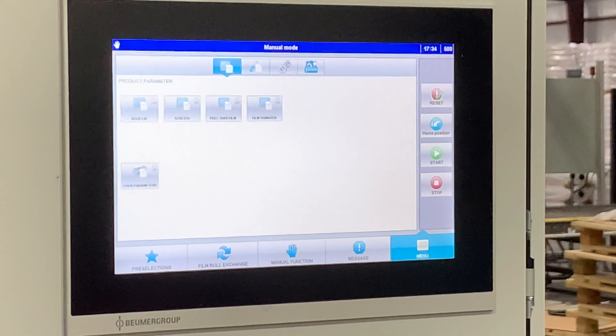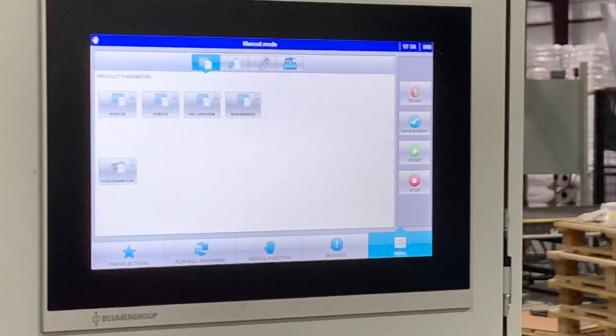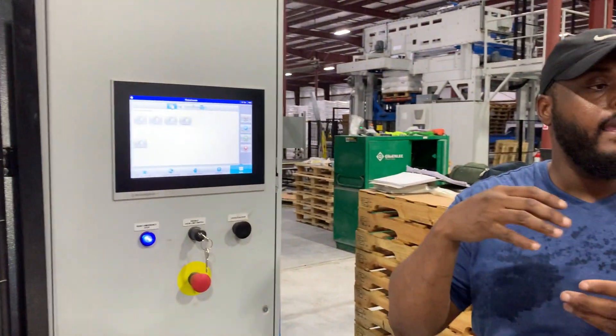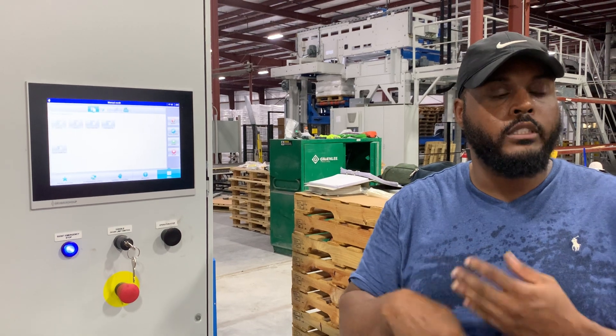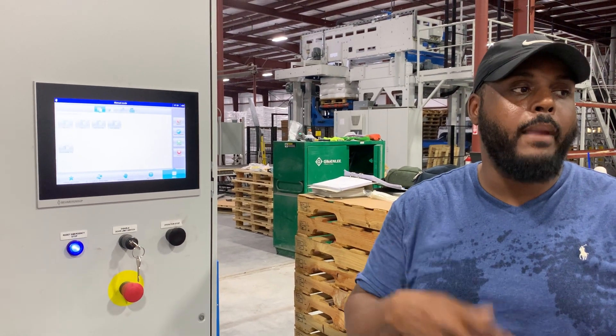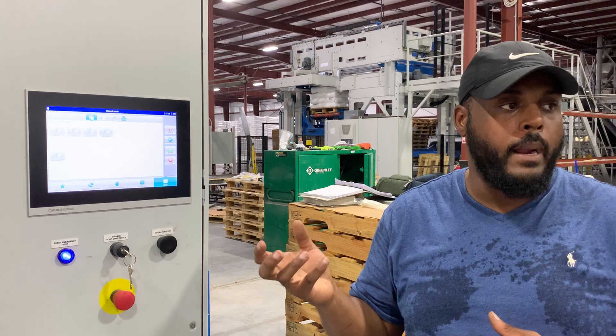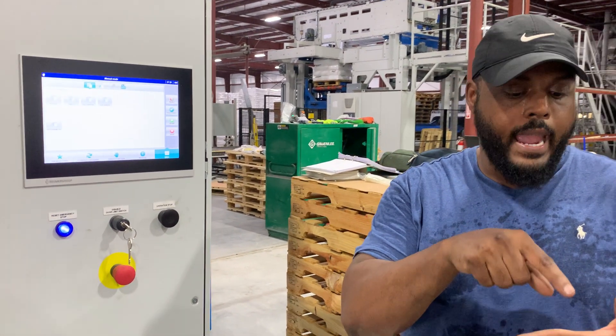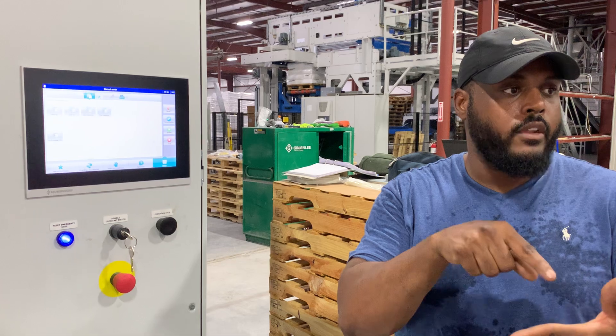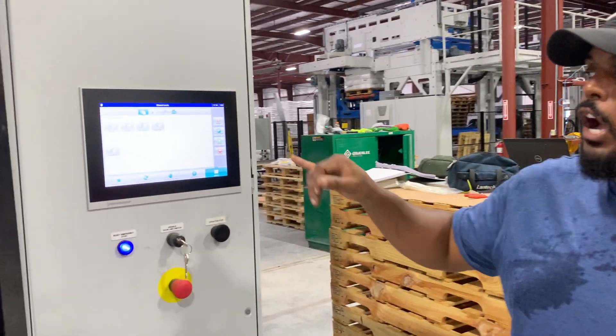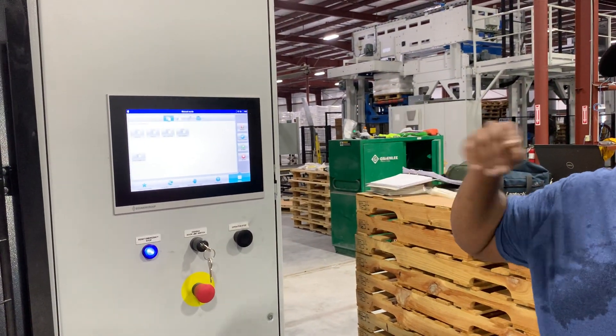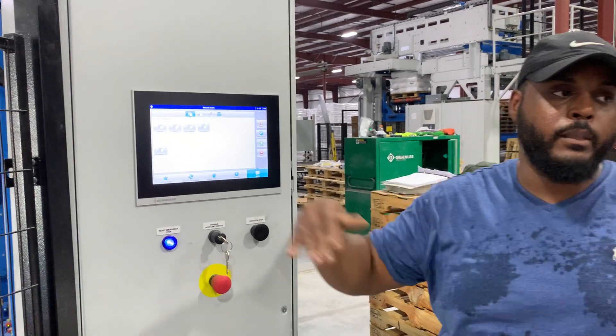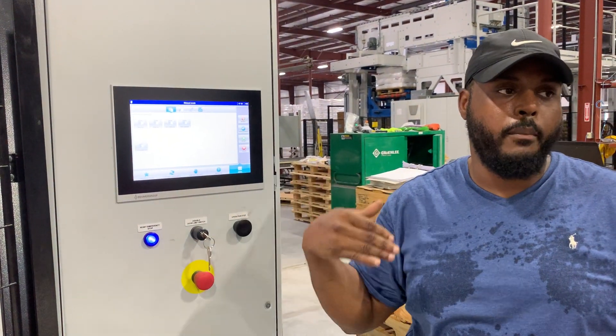If I press that, it'll save it to the USB stick. Let's go back to messages menu. This is where you start to get to your parameters. It gets a little complicated now. The most important thing is to log all your parameters, write them all down.